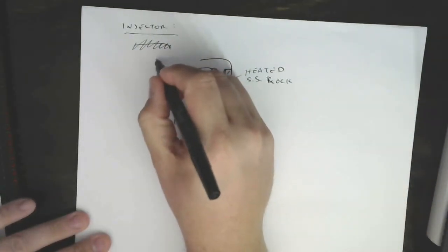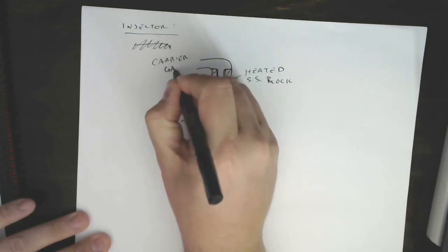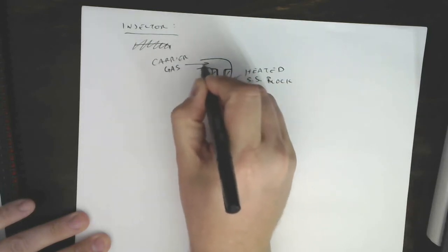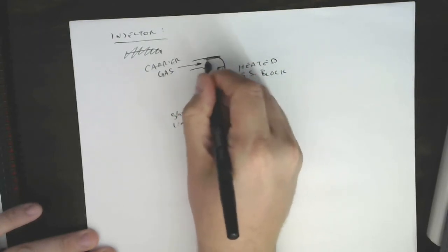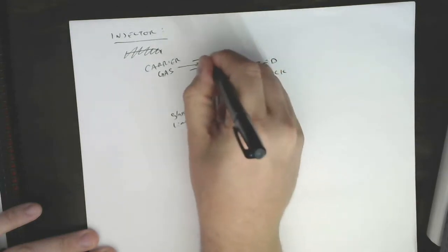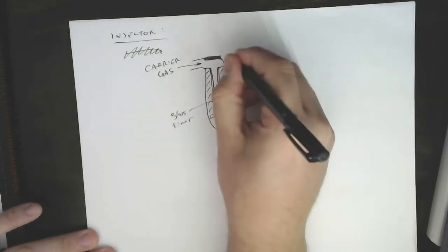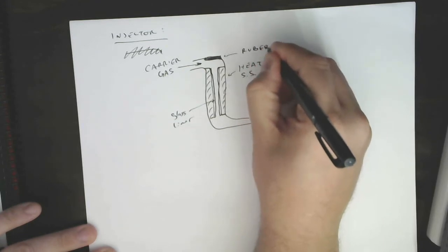Our carrier gas is entering this way. And we have at the top here, trying to draw a thick box, there we go, a rubber septum.